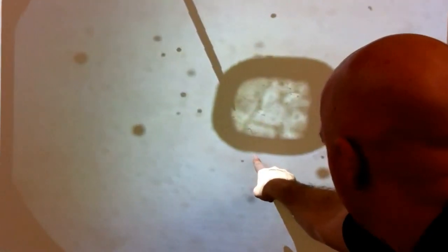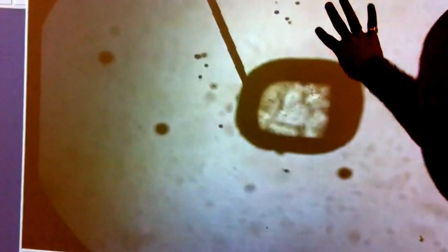Oh, I see it! The black line along the edge—it's just coming off. You can see the flow. I will zoom in even further.